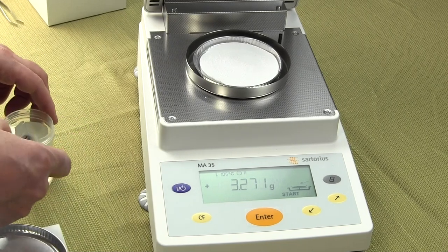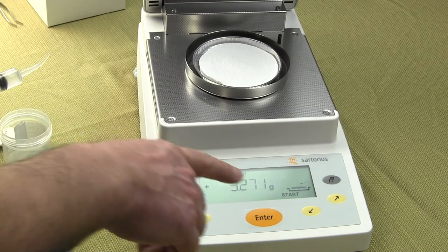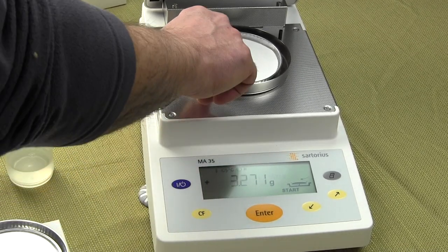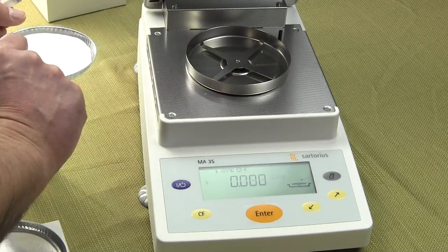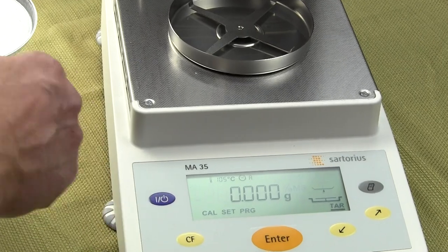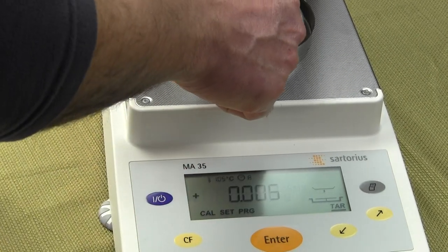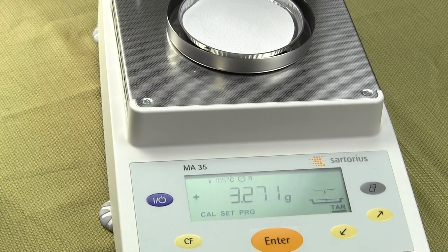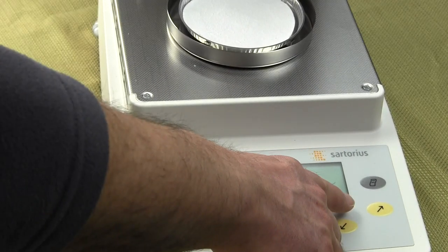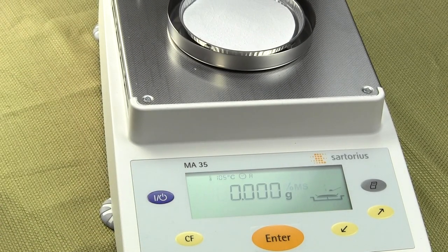When you set up your balance, put the pan and the pad on — you'll notice we need to tear it out. Hit clear to start, and the display shows zero. I put my pan and pad on the moisture balance, and the first thing we want to do is tear it out. Tear is highlighted, so we hit enter, and now it's been tared.